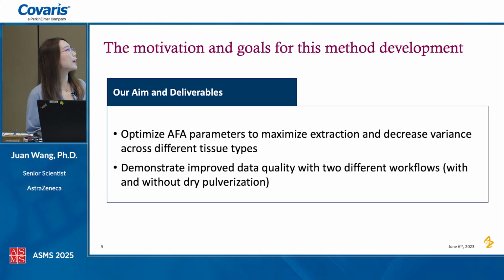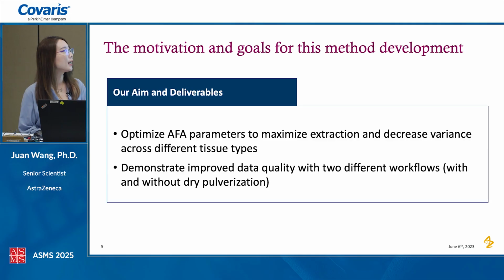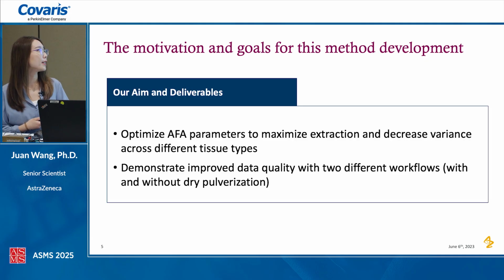So our motivation and goals for this method development are first to optimize AFA parameters to maximize protein extraction and decrease the variance across the different tissue types. And also we want to demonstrate improved data quality with two different workflows, with dry pulverization and without dry pulverization.